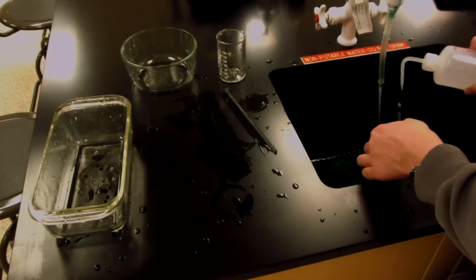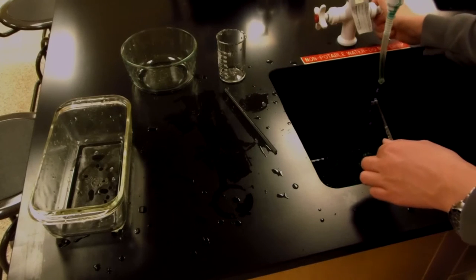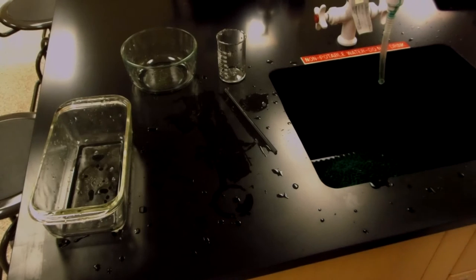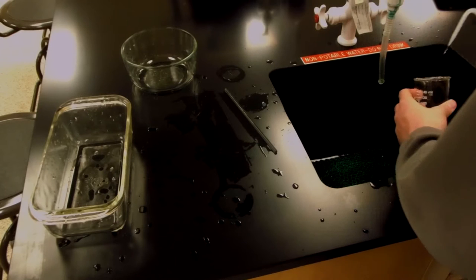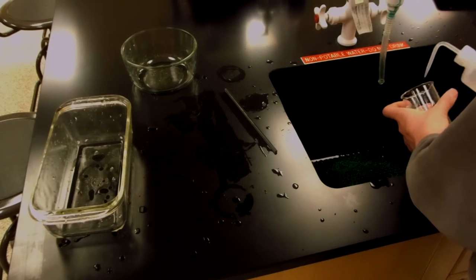Okay, so I paused the video, and now I let the dog in, and now I'm back. So I just finished washing both stirring rods, and it's pretty simple, as there are no inner surfaces on the stirring rods. Now my last beaker is washed the same way as the other beakers. They don't take too long.